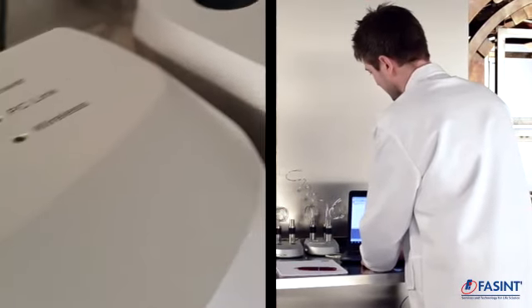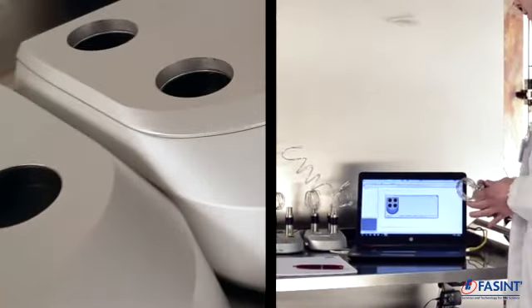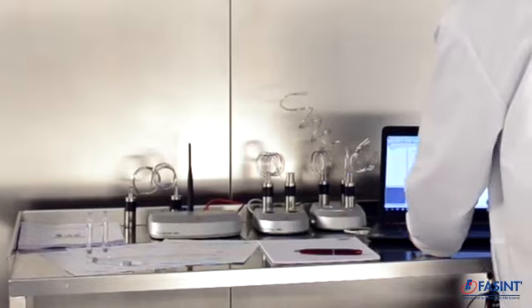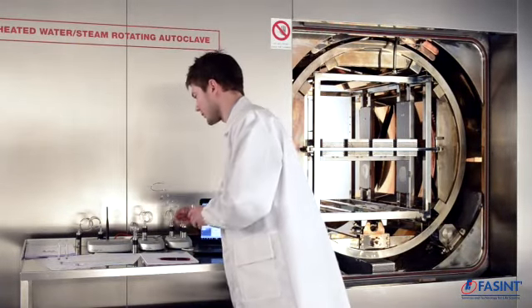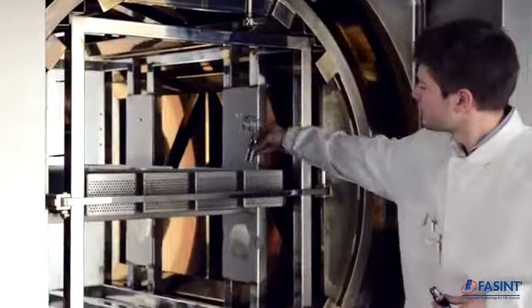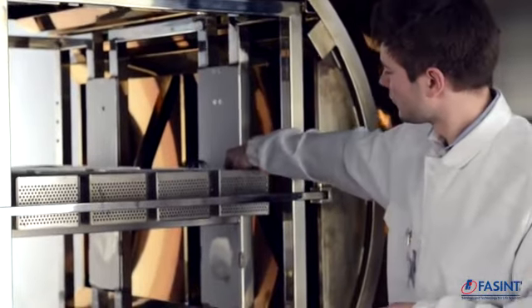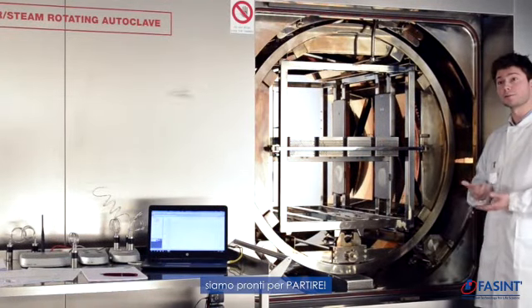We are ready to start. TrackSense — Start Logger. We get a picture of our loggers identified in the registration by the zero number of the sensor. We are prepared to place the loggers in the chamber. I have my loggers with me. We place them and we are ready to go.